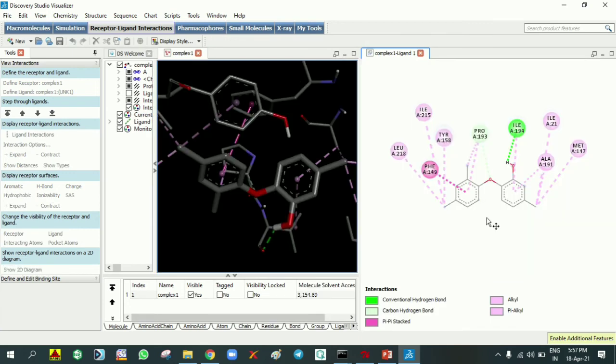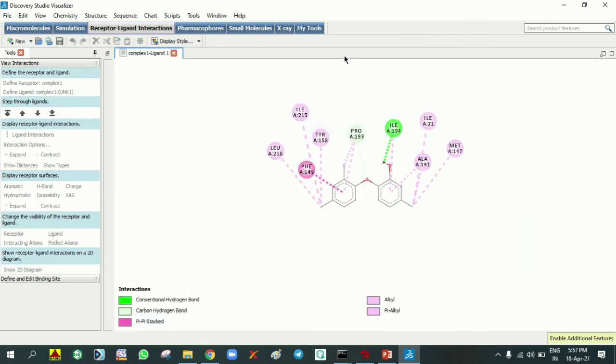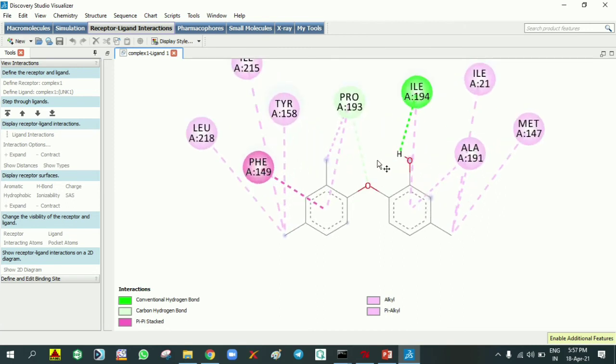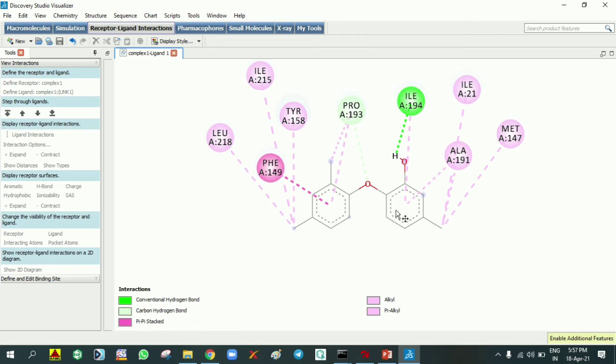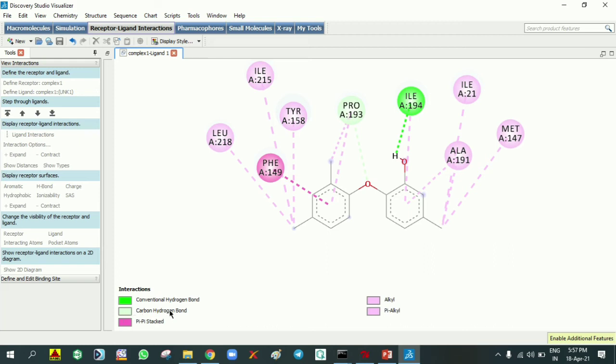I am increasing the size for visualization. This is triclosan drug. It is binding with one hydrogen bond interaction, making with isoleucine 194. This green color is indicating the conventional hydrogen bond, and white color is indicating the carbon hydrogen bond. This pink color is indicating Pi-Pi stacking with phenylalanine. Light pink colors are representing alkyl and Pi-alkyl bonds. The ligand is making interactions with the protein.